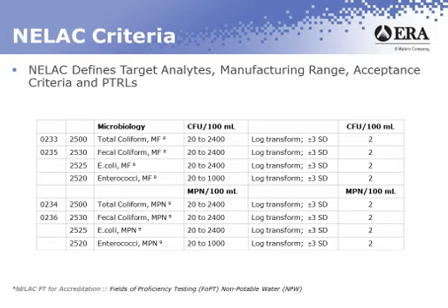So that should give you the idea. 9221B would be an example of total coliforms by multiple tube fermentation. That would be reported as total coliforms MPN. So all of these data points that we collect need to be sorted according to how they're being reported.